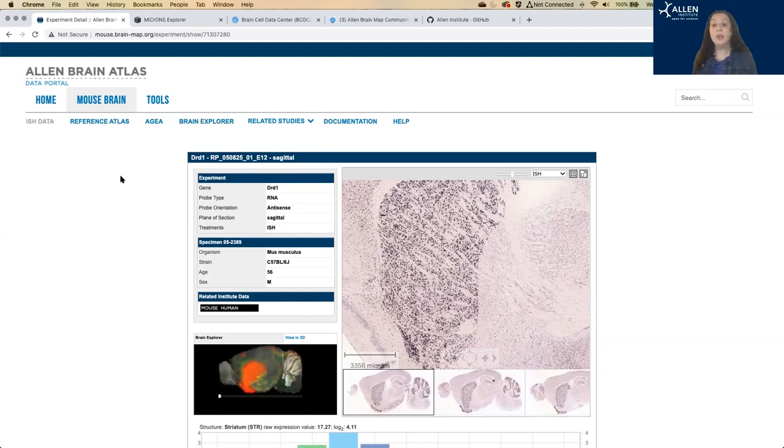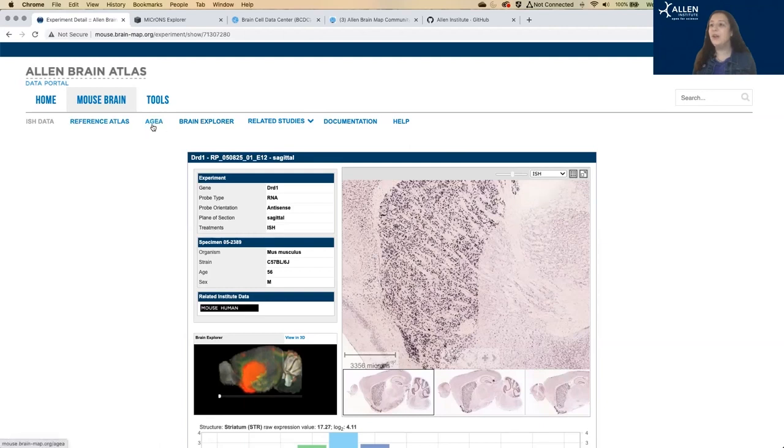There's another main way to explore the mouse brain atlas data. And that is the Allen Gene Expression Explorer. So if you look in the header here, we see AGEA.